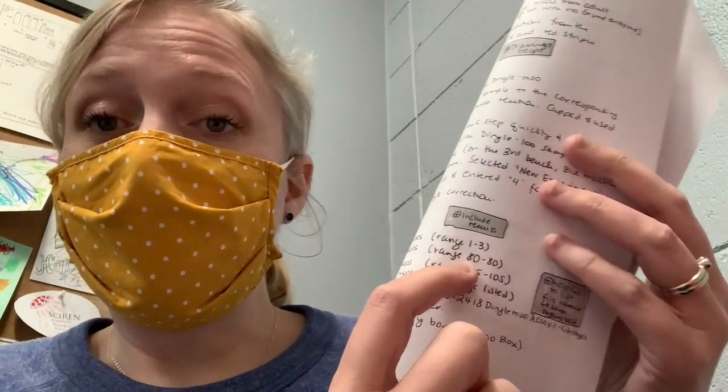You're going to include all of your results, which is one thing that a lot of people forget. So after you finish your experiment, what is the result of that experiment? It might be measurements or pictures of animals or pictures of gels in your records. And if there's digital information associated with this experiment, you'd want to list all of those file names. So say you were doing an experiment where you were going to do imaging. You would image your animals, you'd have files for each one of those images, and the names of those files would be in your notebook as well.